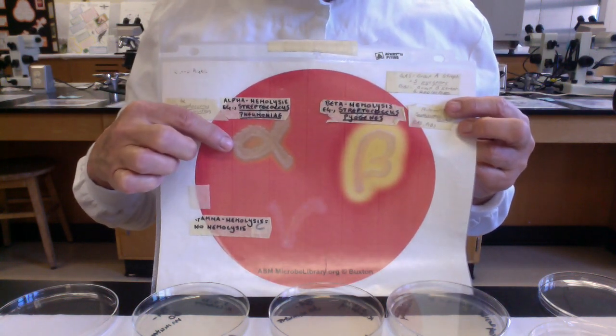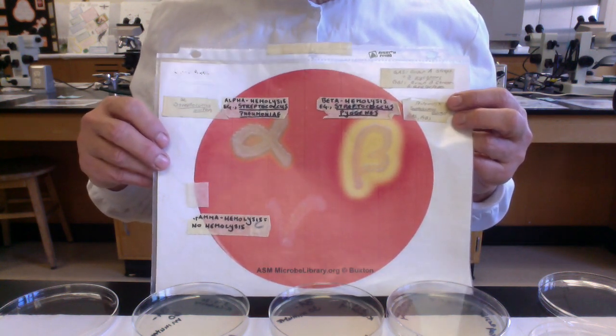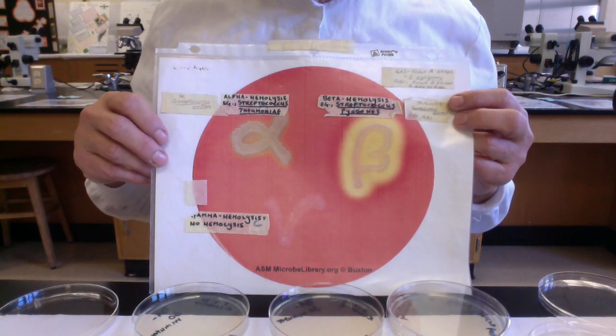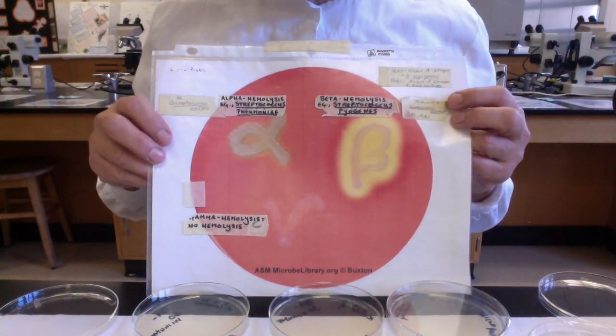So here we have what's called alpha hemolysis. It's a darkening, a greening of the blood agar. It's often referred to as incomplete hemolysis, meaning the red blood cells are broken open but the contents aren't totally destroyed and we get this greenish discoloration.